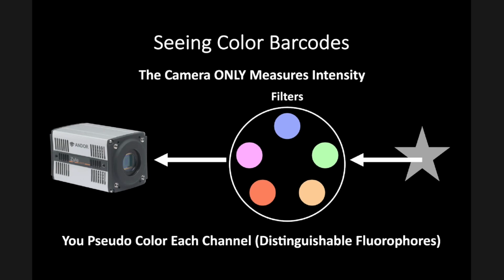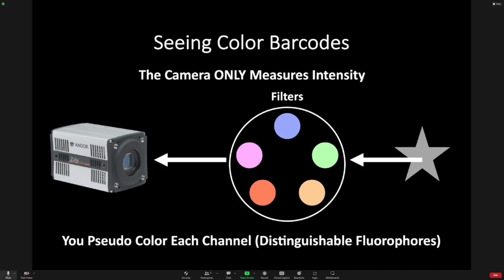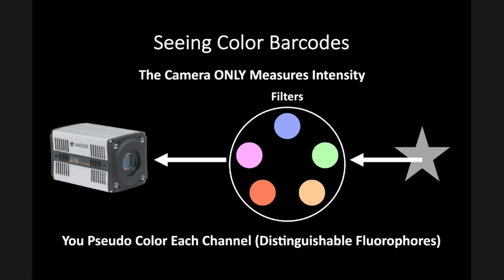And the key thing here is because I need to build a palette of colors, and I need red, green, and blue as barcoded colors, GFP, which is part of the mix here, is not going to be colored green in this presentation. It's always going to be white. And that'll all make sense in a second. So when you see green, you're not seeing GFP, you're seeing a totally other fluorophore, which happens to be red, and I just switched to color green in software.